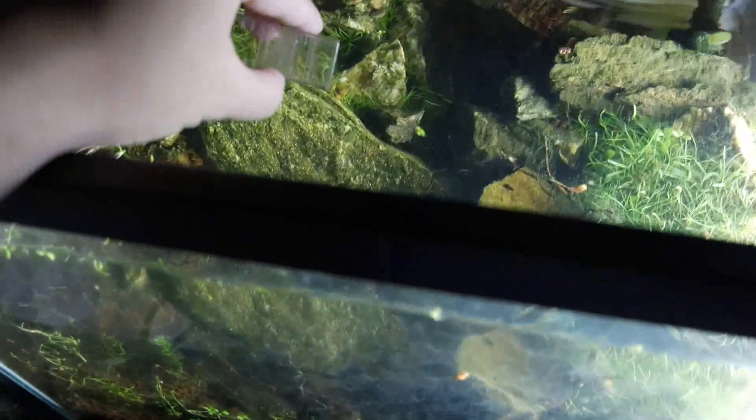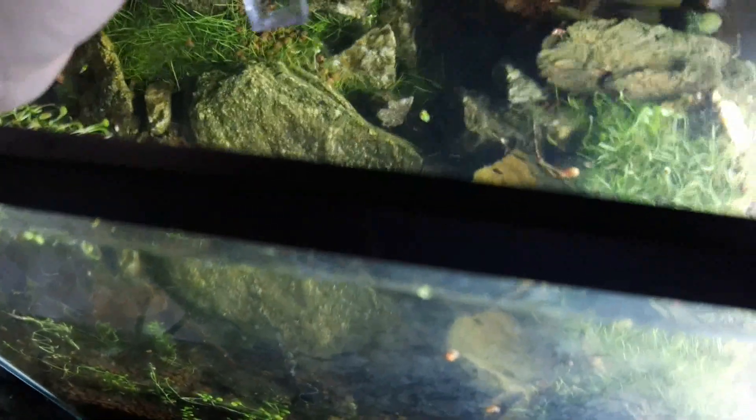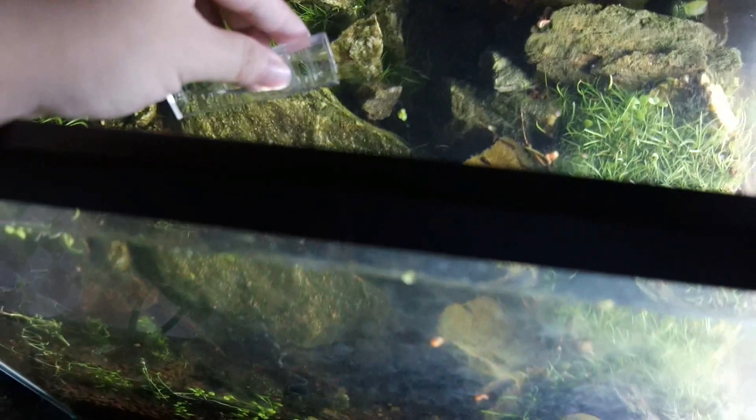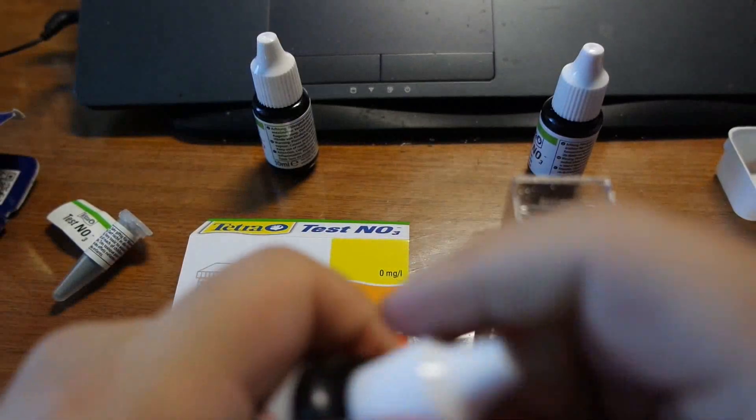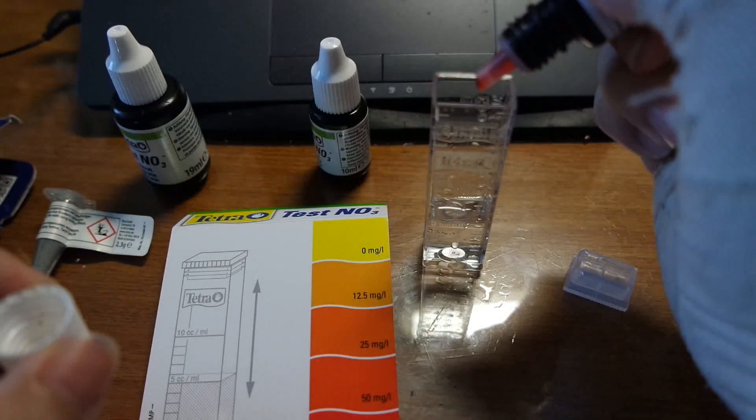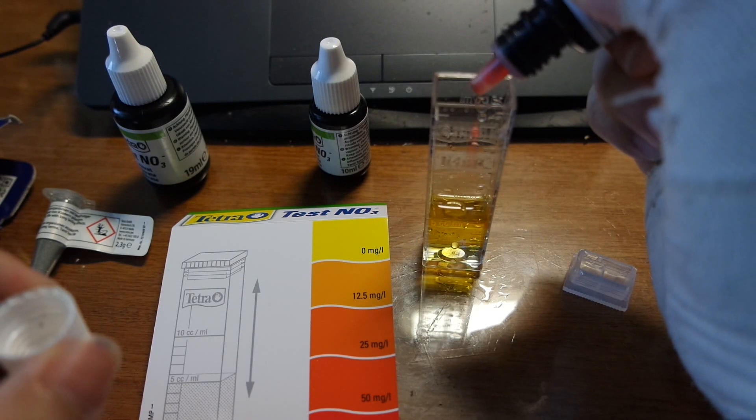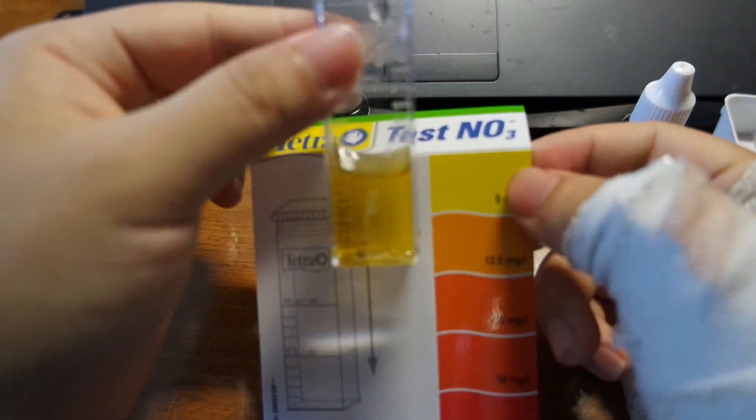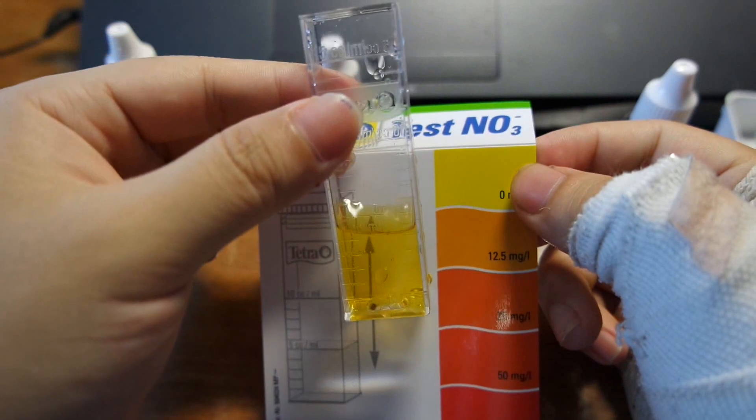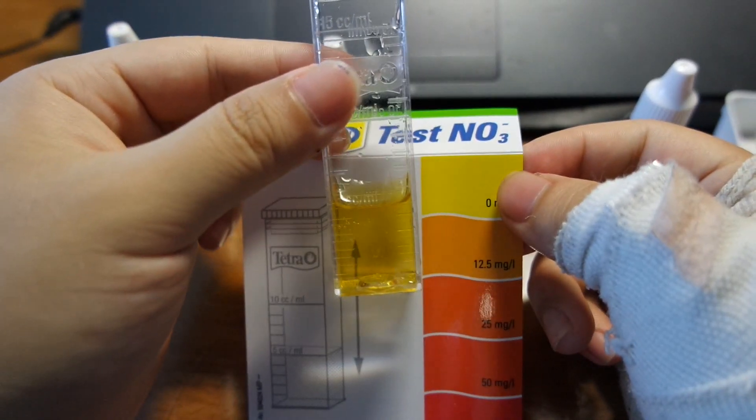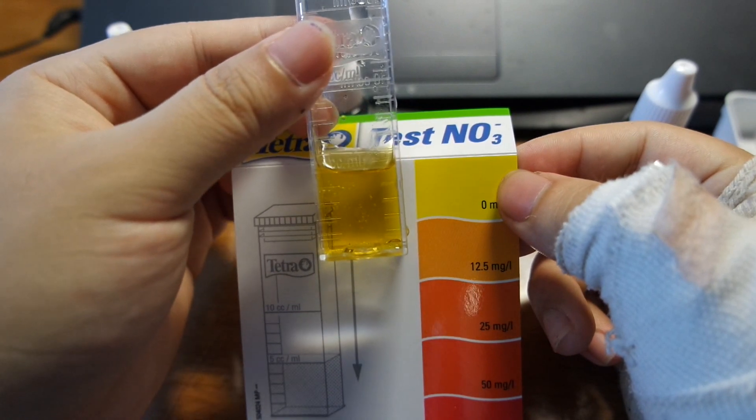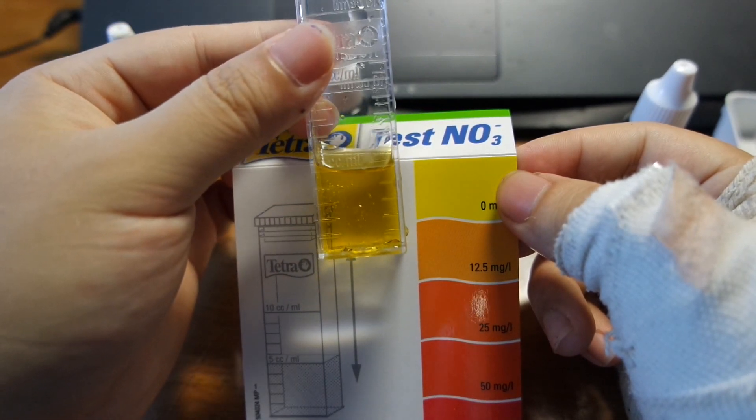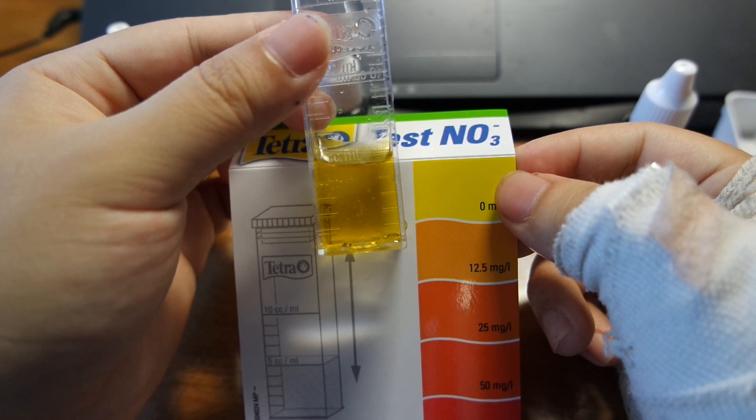Okay next up is my 12 gallon planted aquarium. I will be getting a little bit of water here. Basically I will be doing the exact same thing here. Okay so it has been about 10 minutes and the reaction is complete. Let's look at the color and the 12 gallon is also right about 0 there. It is pretty yellow so that is good. So my 12 gallon planted tank also has almost no nitrates.